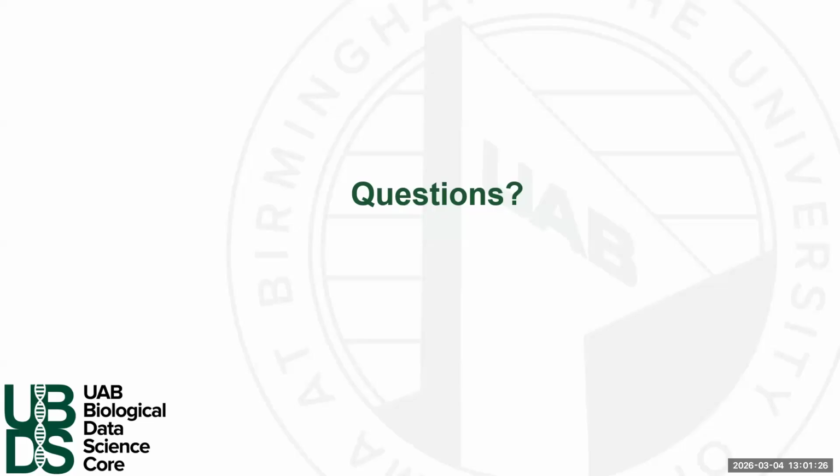Yeah, no, that's a good question. I have not thought about that before, but that might be a good one. Now, I will say some of the HTML files that are produced, a lot of the data is repeated in the MultiQC report. So that's why we've not overly worried about that. But there are some tools that don't. Specifically, the ToulligQC tool is one. MultiQC doesn't have a module for that yet. But the bottom line is, outside of ToulligQC, everything else should be compiled in MultiQC. I agree that that is a great idea. I might think about that.